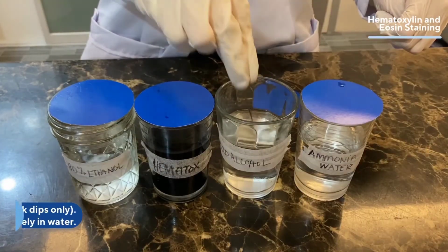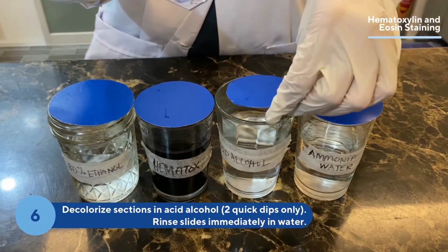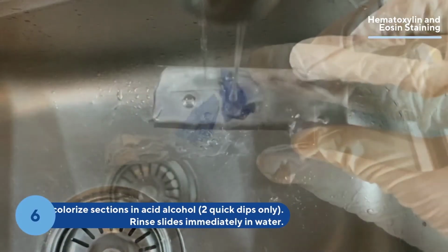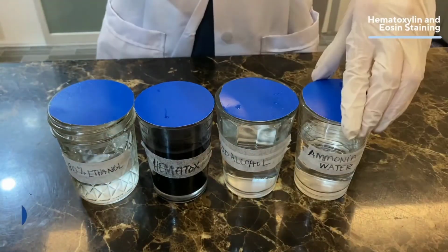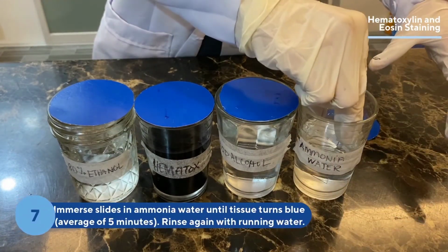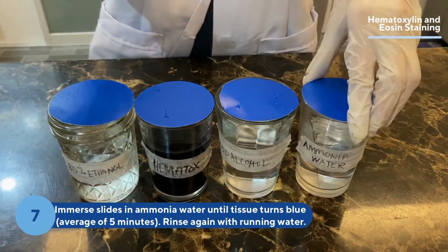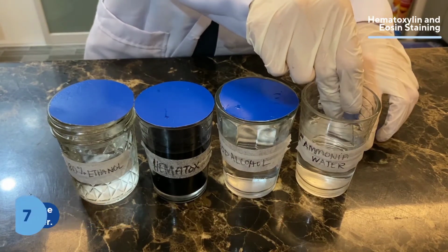For the sixth procedure, I will decolorize the tissue section in acid alcohol with 2 quick dips only. And then after, I will rinse the slides immediately in water. Seventh, I will immerse the slide in ammonia water until the tissue turns blue, for an average of 5 minutes. And after 5 minutes, I will rinse it again with running water.